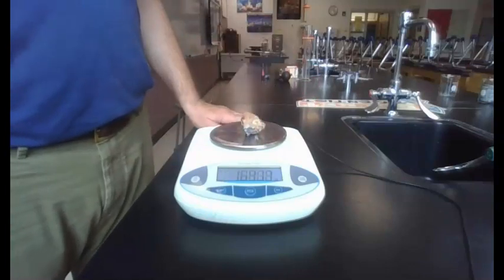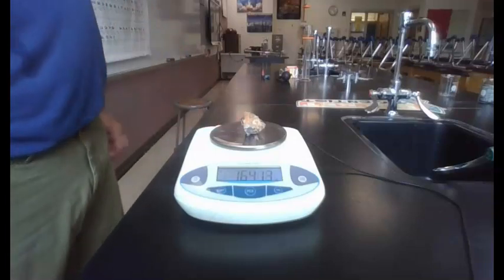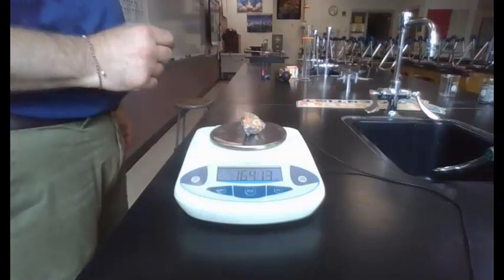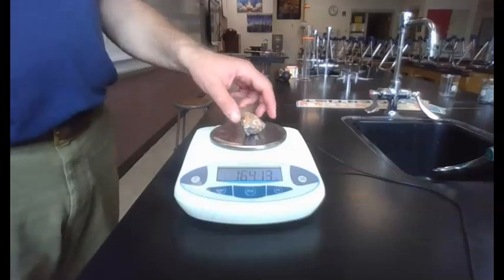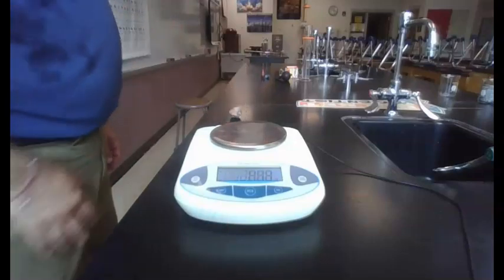Boom, it tells me my galena rock weighs 164.13 grams. If I took this rock to Mars, it would weigh less, but its mass would be 164.13 grams, the very same. Now, what happens if we have a container?